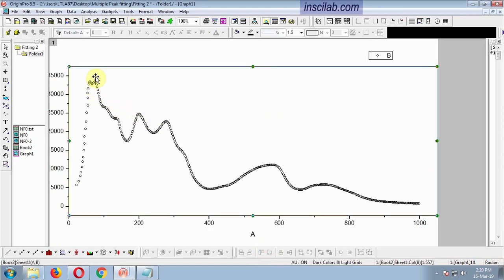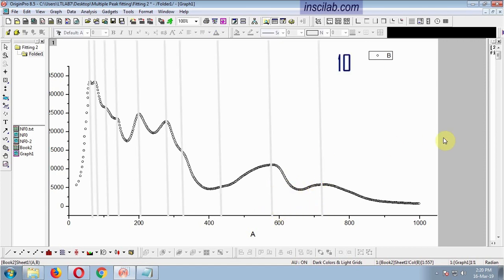Now, inspect the spectrum. Count the possible minimum number of peaks. This quick inspection shows that the number of peaks cannot be less than 10.